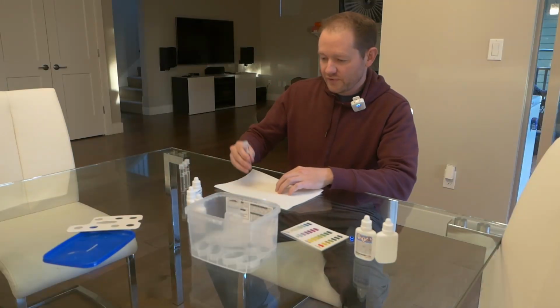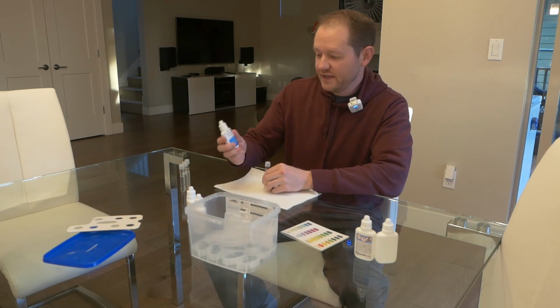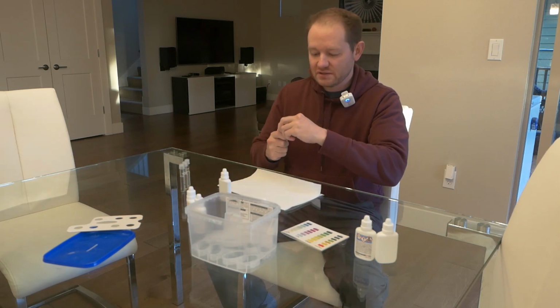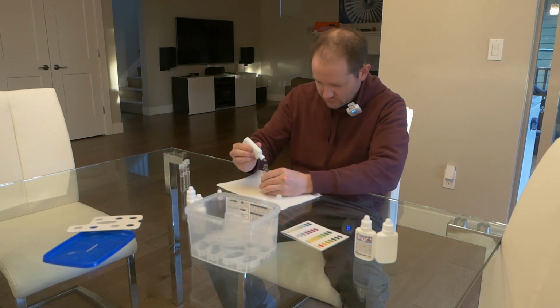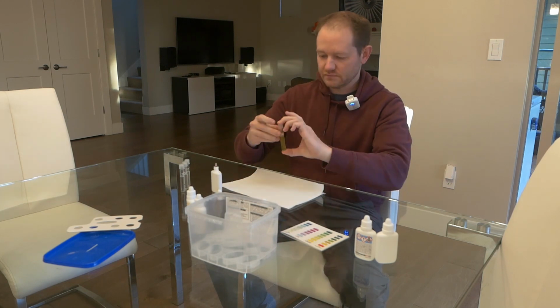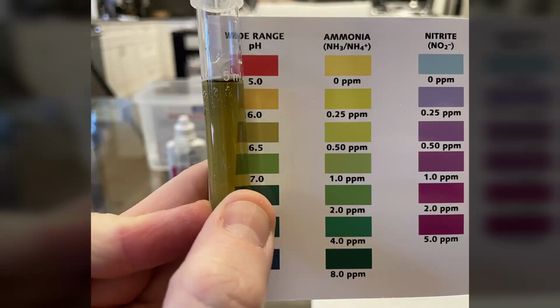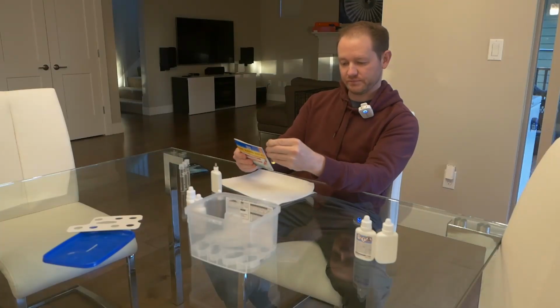All right, we'll start with our pH test. Pretty easy. We have the blue bottle and we just simply add 5 drops. All right, so we're looking at about 6.5, which is probably low, so I'll probably have to raise that up a little bit.